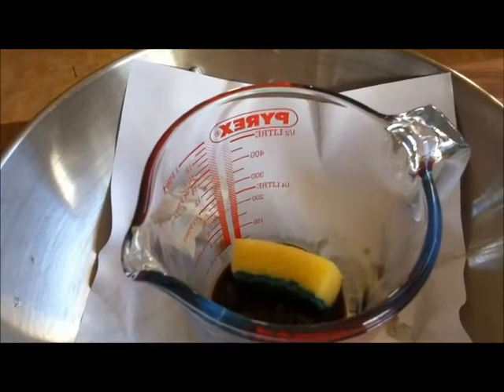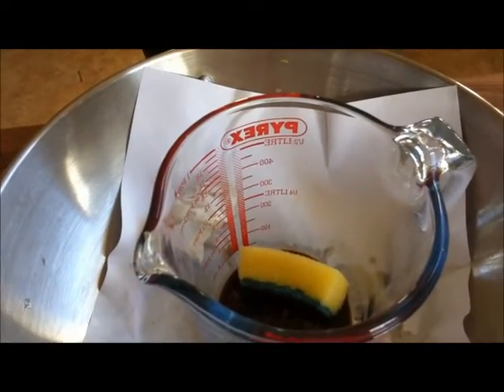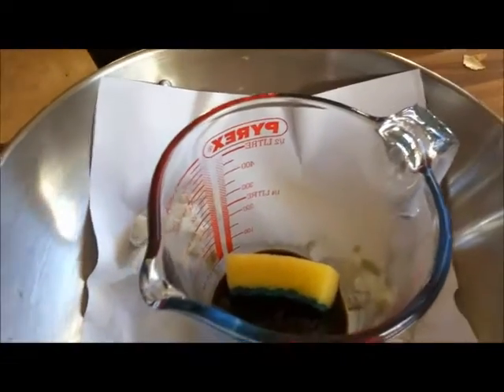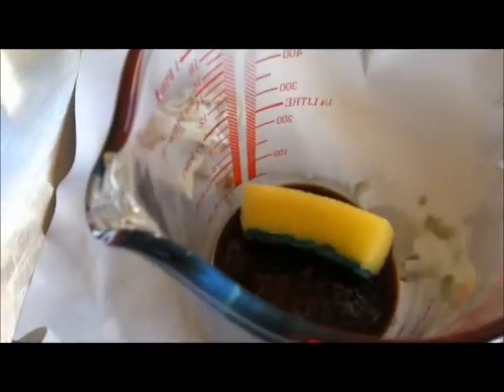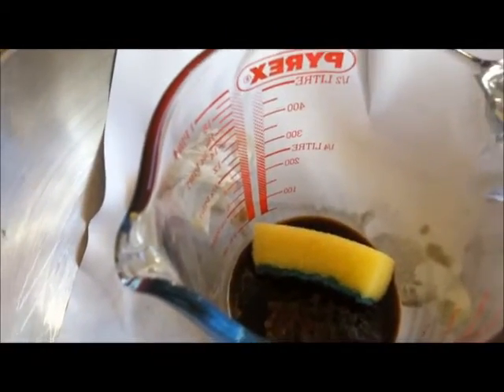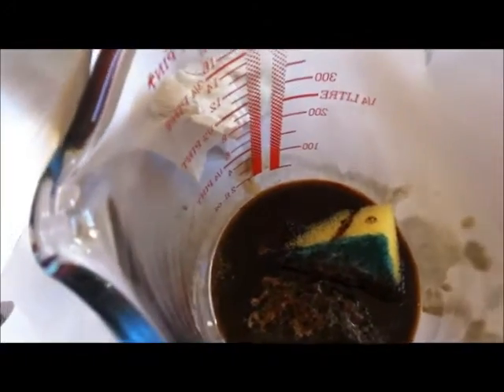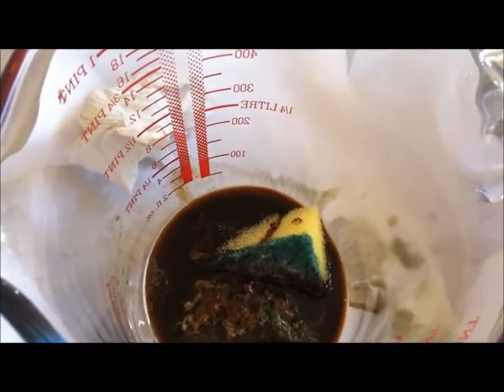So you want to be really careful. If you're unfortunate enough to get this stuff on your hand, wipe off the excess with a paper towel and then rinse your hand under cold water once you've got all the excess acid off your skin. Do this as quickly as you can, otherwise it will just eat through your skin like it's doing to this sponge. I came back a couple of minutes later and as you can see there's not really much left of the sponge - it's almost completely gone. I reckon maybe another 10 minutes and the sponge will be gone completely.